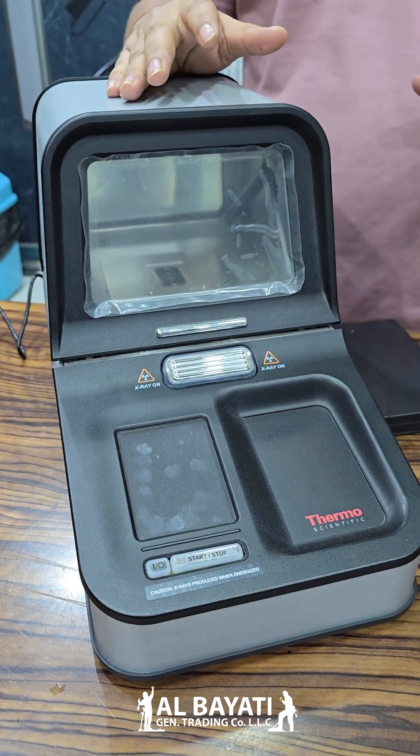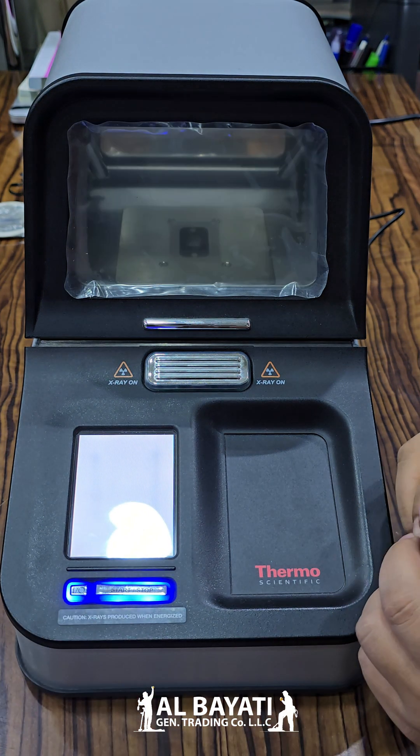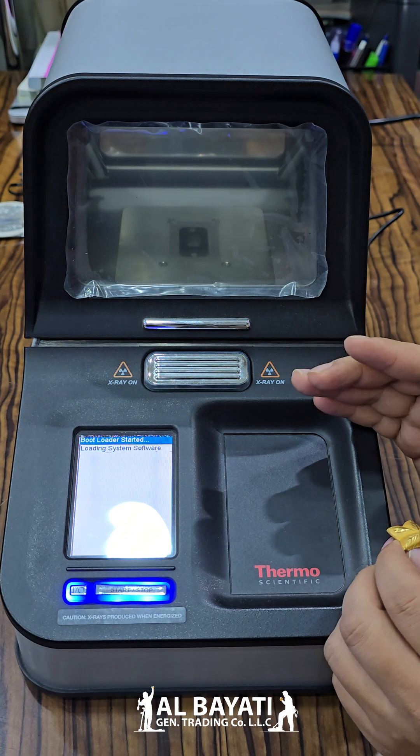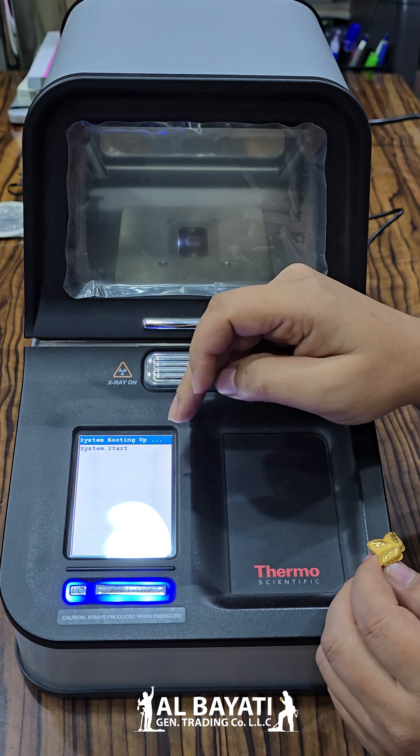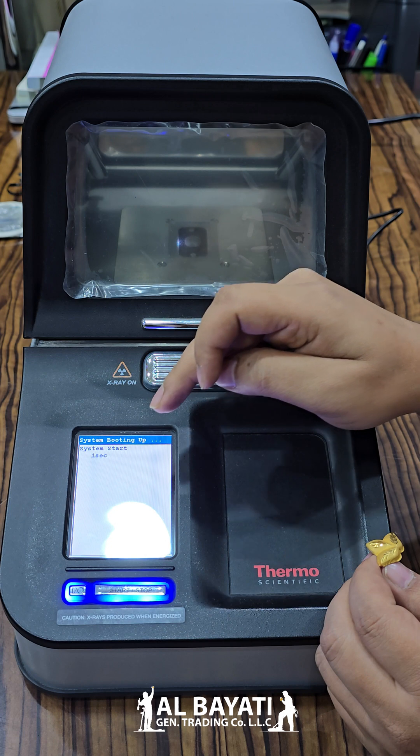I will show you how to use it. You press this starting button. Now it starts. Come in right here. Hold for 5 seconds — 4, 3, 2, 1. Start now.